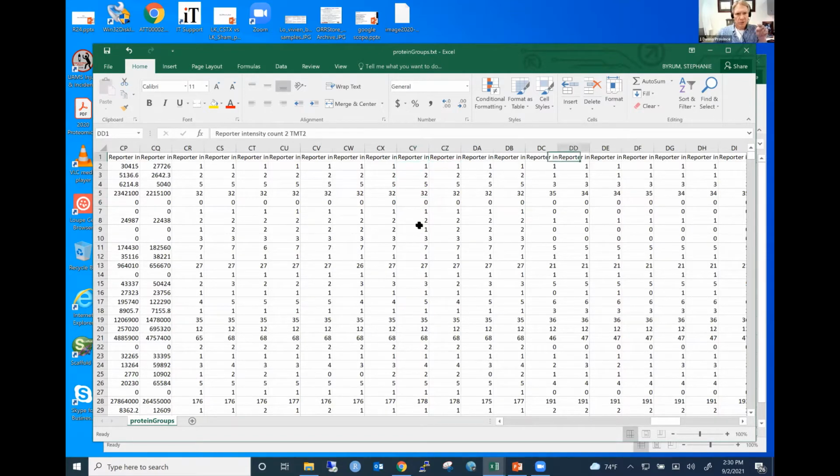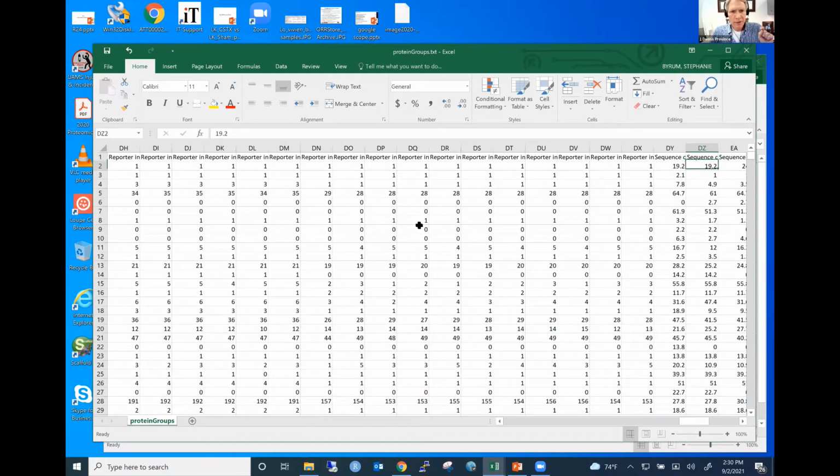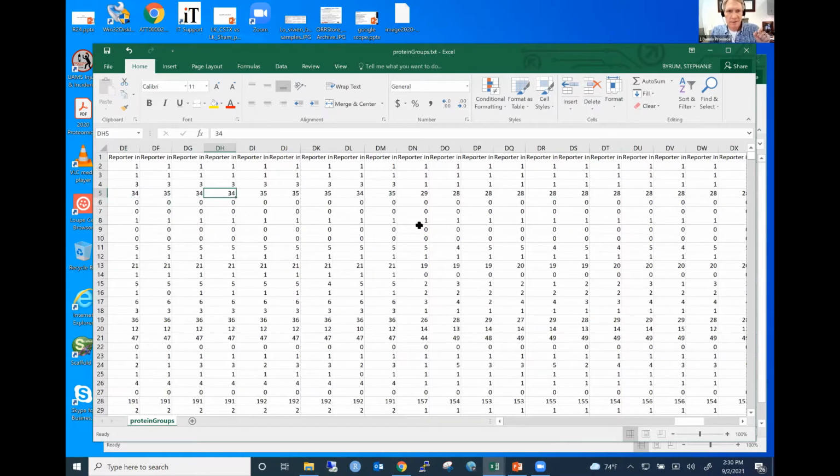Stephanie, can I just ask a question there? So the one that has 34, that would have maybe 34 different peptides that all have those tags. Yeah, MS2 spectra that corresponds back to that particular protein. Well, the other one maybe just has one. We only found one peptide, so therefore it was only one tag. Right. Does that seem okay?